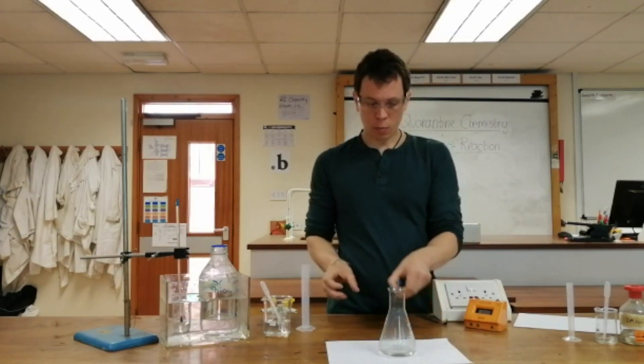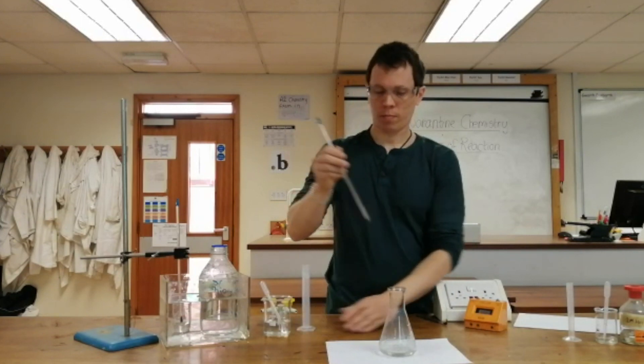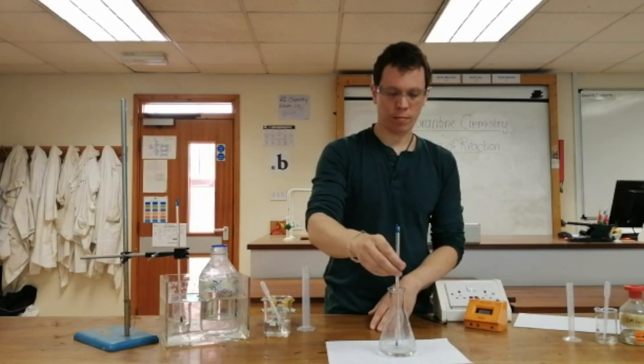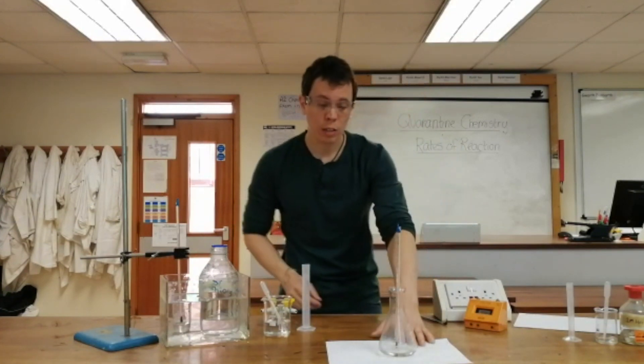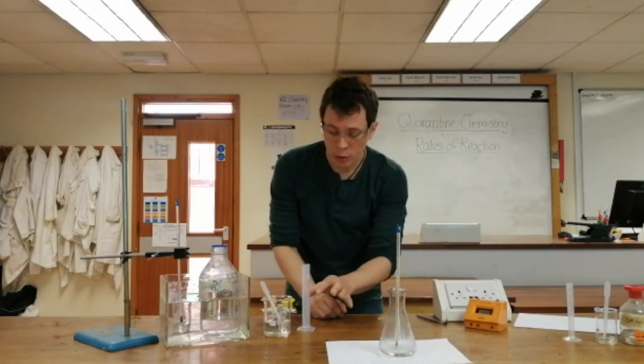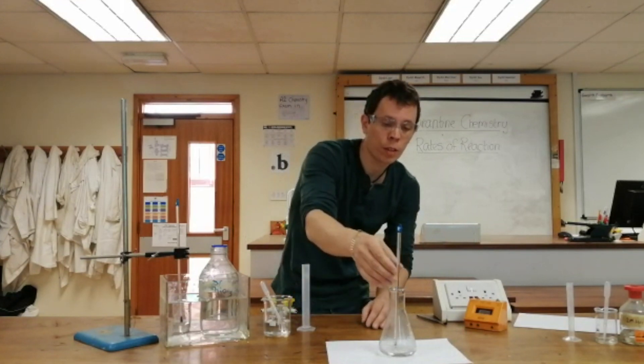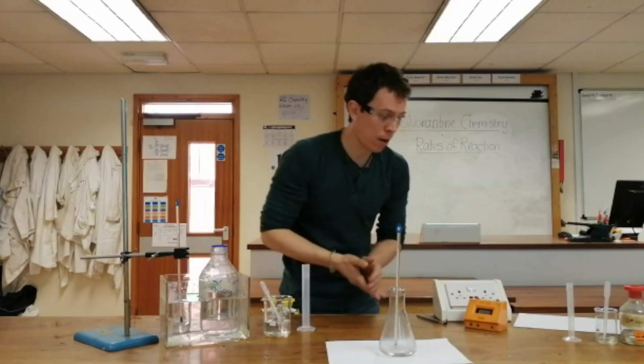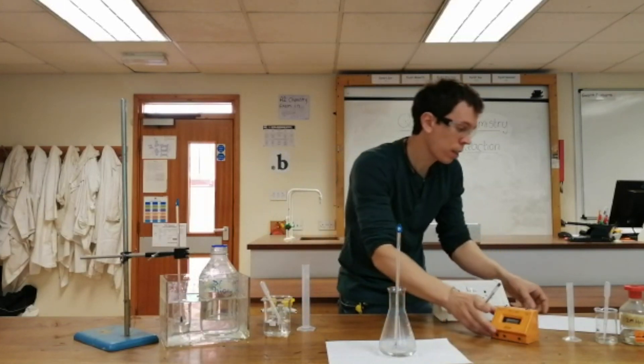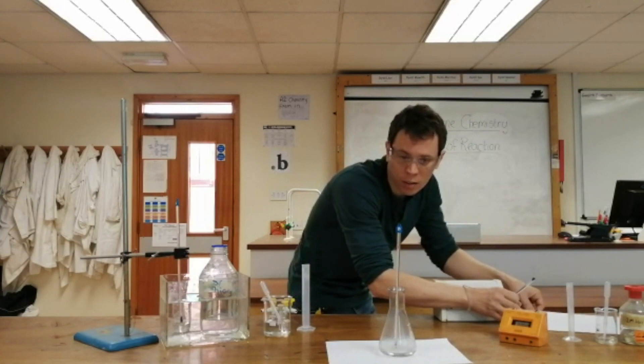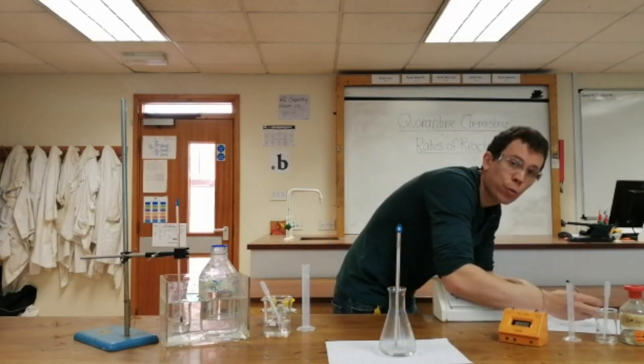I'll pop my thermometer in. I'm using the same cross as last time to make it a fair test. I'm using the same volume of sodium thiosulfate, but it's going to be at a different temperature. Looking at the thermometer now, my temperature for my second reading is 42 degrees.